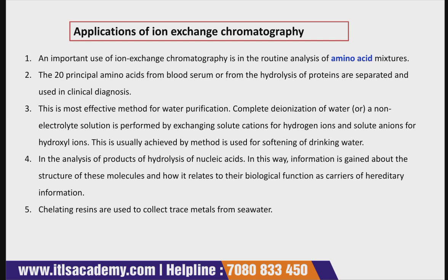This is the most effective method for water purification. In water purification also, ion exchange chromatography has a huge application. Complete deionization of water or a non-electrolyte solution is performed by ion exchanging solute cations for hydrogen ions and solute anions for hydroxyl ions.